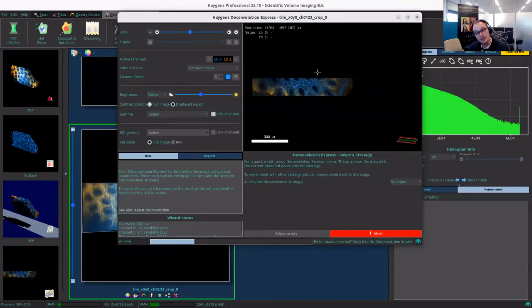And whenever it is currently doing a calculation on a certain piece of image, it moves that image to the GPU, right? And if it's done with it, and it needs more space on the GPU, then it moves it back to the CPU. So Huygens is dynamically moving data between the CPU, so the regular RAM, and the GPU RAM, in order to optimize the performance that is happening here right now.